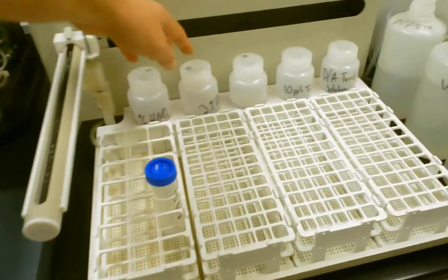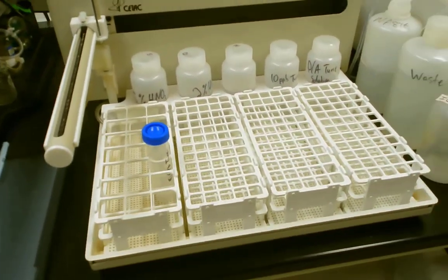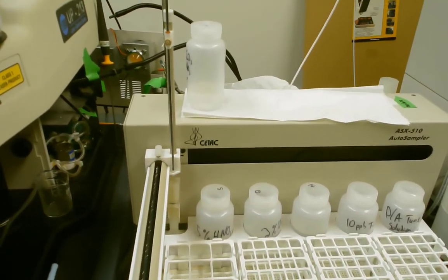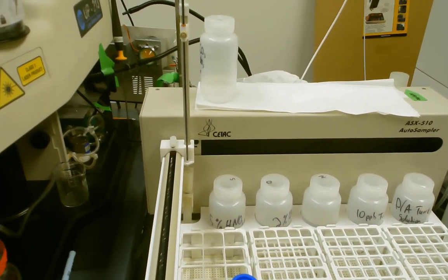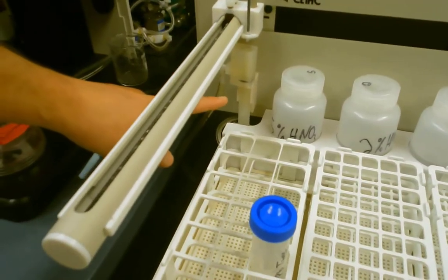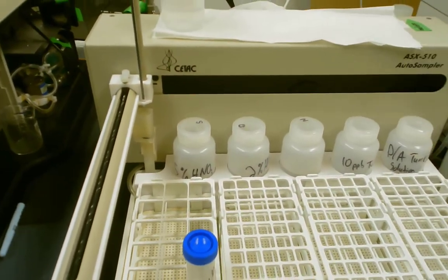The bottles in the back here are rinse bottles / standards. So those are used for rinsing the probe. So the probe is located here, and the probe is what goes down and dips into each standard and each sample, and then it is rinsed through water at the home port here, as well as the different rinse bottles there. Okay.